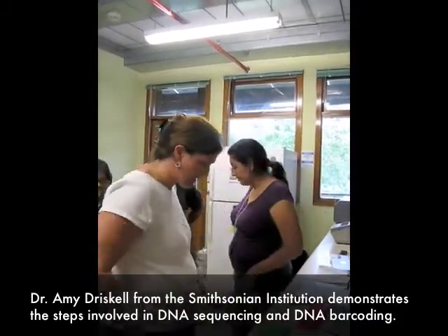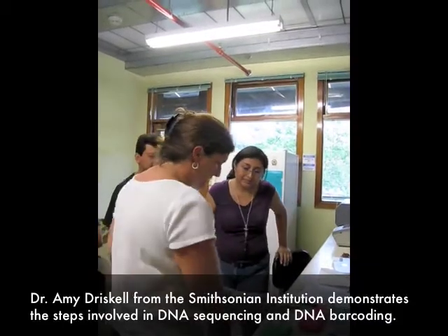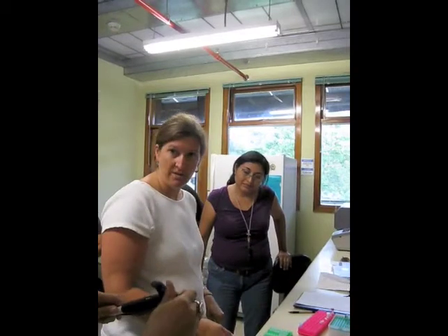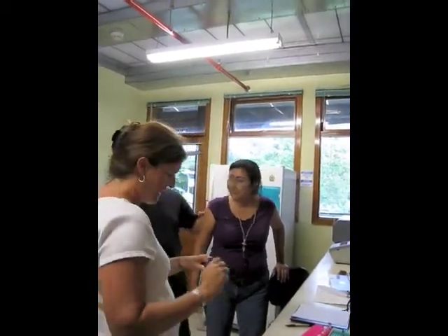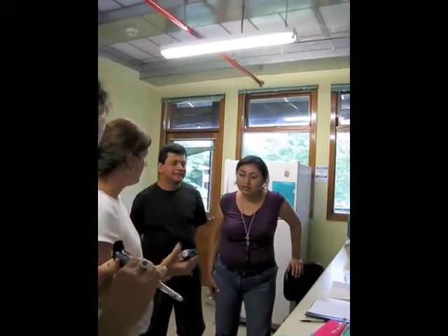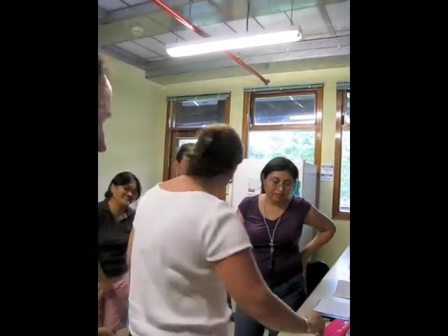Alright. And now, we need 20 microliters of this and each of these. 20? Yes, 20. Okay. Why do you want that? Get this one. And then pipetting has to be accurate, or we'll run out of solution part way down. Okay.